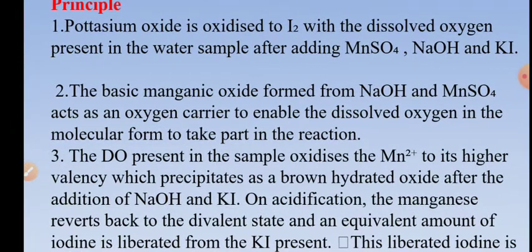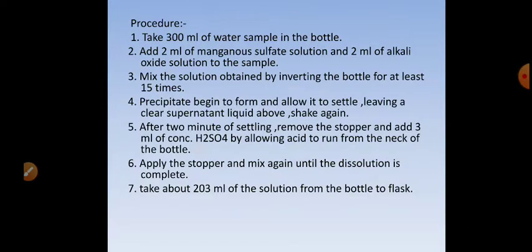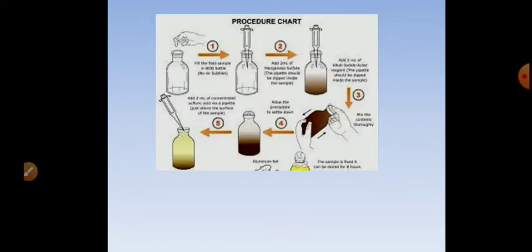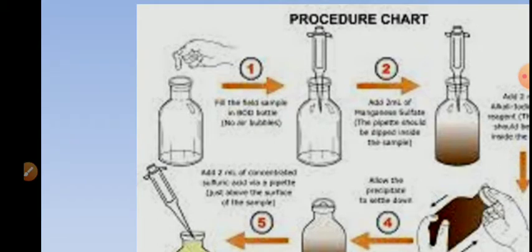Now, first we'll discuss the procedure, how to perform it, and then we will switch over to the principle. The first thing we need to take is a BOD bottle. It is of 300 ml capacity, having a glass stopper. The bottle should be clean.